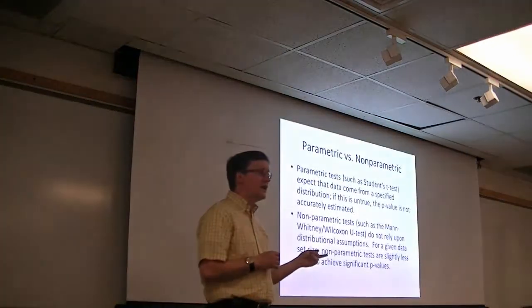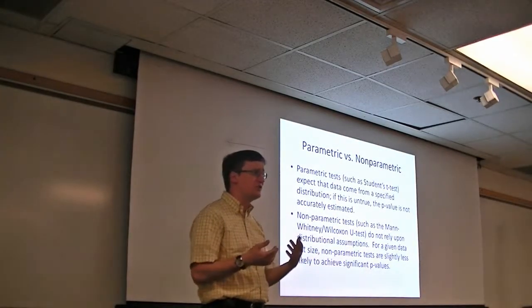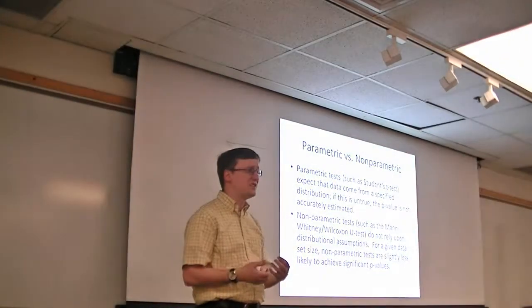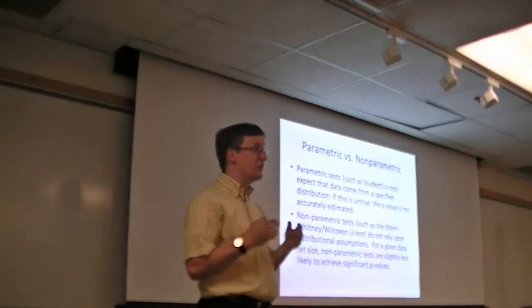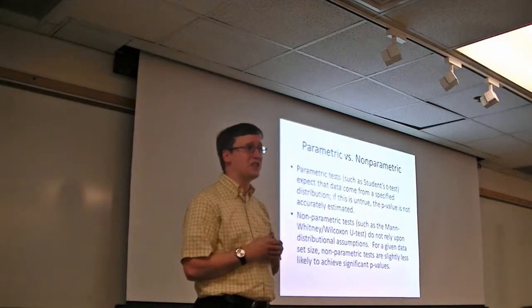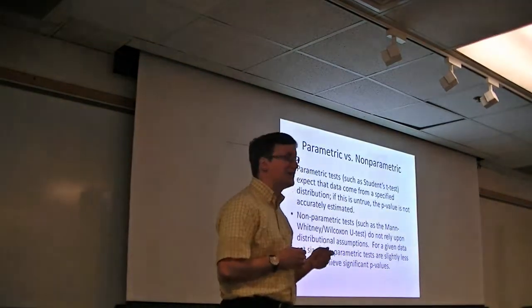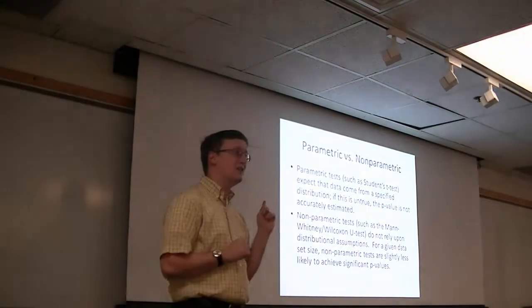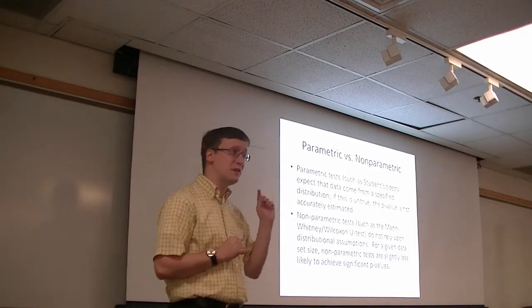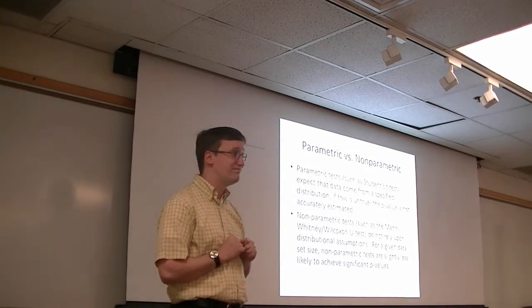And as we talk about variation, we should also be thinking about the expectations of the statistical tests that we're using to make sense of those data. Now, we frequently hear the terms parametric and non-parametric when we're dealing with a statistician, and some of us might understand what those terms mean, but it's really better for all of us that we understand what those terms mean as we go along, because these have everything to do with what kind of assumptions are built into the statistical models that we're trying to apply to our data.